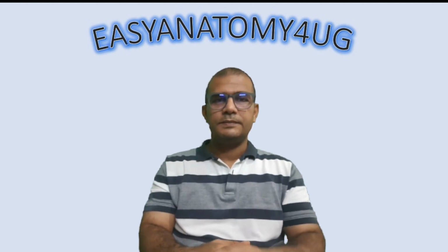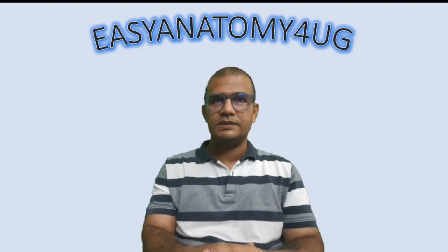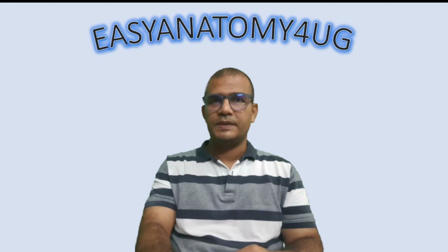In this lecture, we will discuss the important slides of the endocrine system. We will discuss in detail the common slides which have been frequently asked, and we will rapidly cover the uncommon slides. We will only see how to draw sections of important slides, and for the rest of the slides I will share the diagrams. So let us go to our presentation.